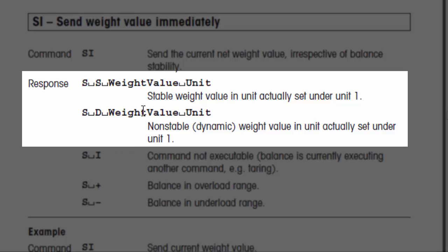If the weight on the scale when we sent the command was non-stable or unstable, we would get back a capital S, followed by a space, then a capital D, then another space, and then the actual weight value again, followed by a space, the actual unit — whether it's grams, pounds, or whatever — and then that's also going to be terminated by a carriage return and a line feed.